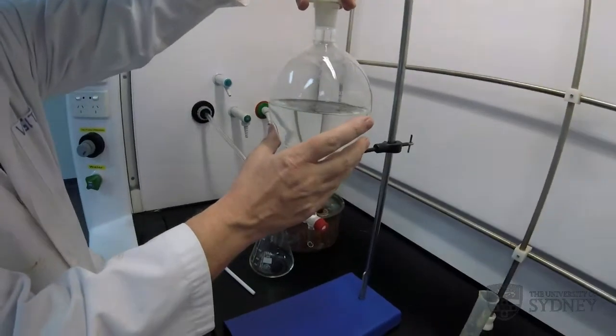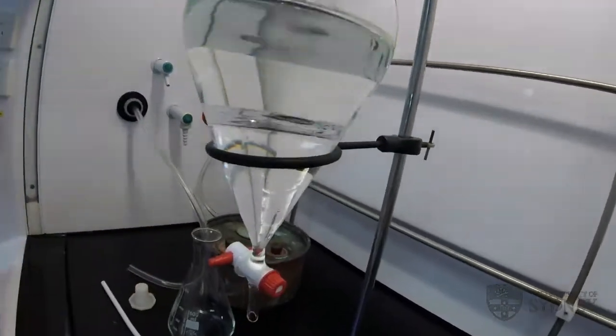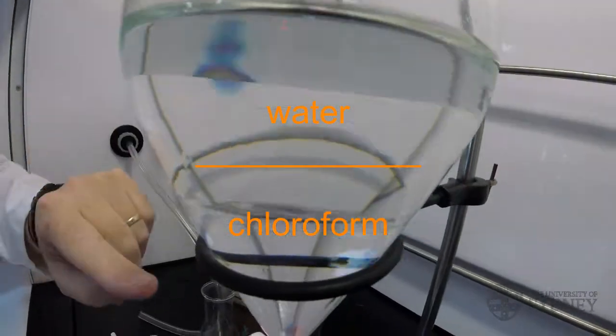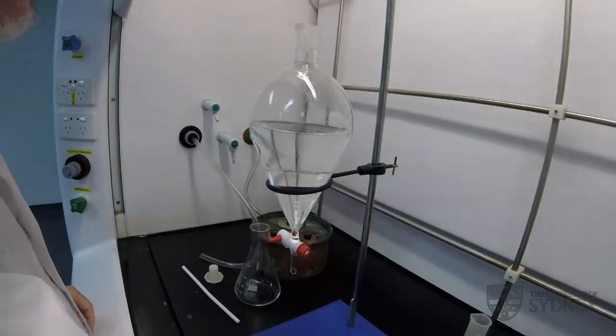So I'll start by adding that into the separatory funnel which already contains two layers of immiscible liquid: water on the top and chloroform on the bottom, because chloroform is more dense than water.